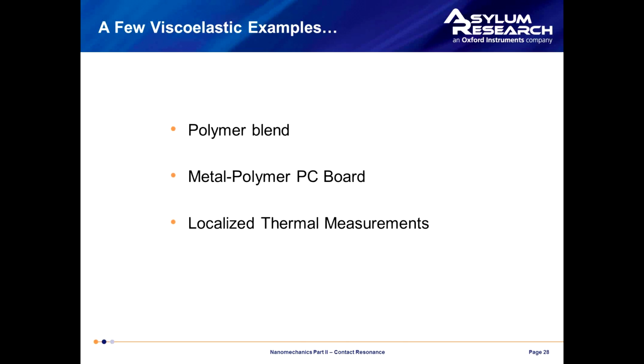Thanks for that, Donna. In the next few slides, I'm going to show you a few examples of viscoelastic imaging with contact resonance. We'll look at a polymer blend, a metal polymer PC board, and then finally we'll look at localized thermal measurements using small heated cantilevers.